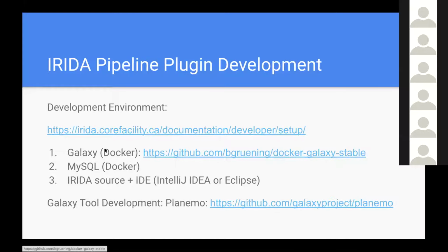You need a Galaxy system. For that, I would recommend using the Galaxy stable Docker container. This has become the community favorite, developed by Bjorn Grüning. It's a very consistent, simple to use Docker container for setting up Galaxy.